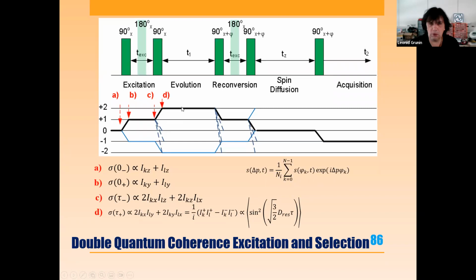Actually, the generation of these transitions happens not immediately. The stronger the dipolar Hamiltonian, which means the stronger the dipolar coupling, for example when you are deep in crystallites, the faster the generation of multiple quantum transitions is. If your dipolar contribution is extremely low, like in liquids, you will not get considerable conversion of single quantum to double quantum transitions from C to D. It means that this technique is applicable normally only to solids.